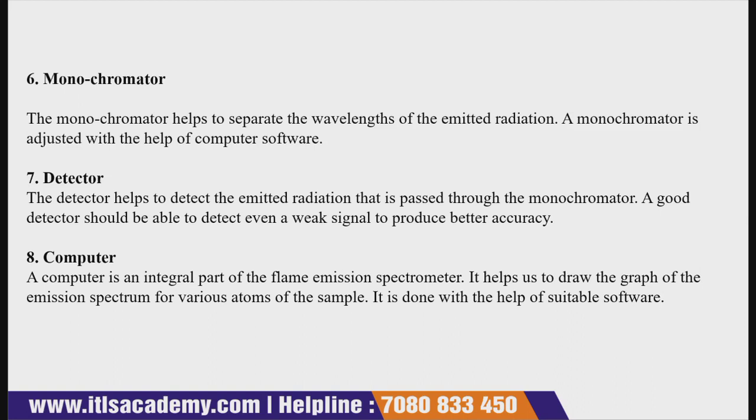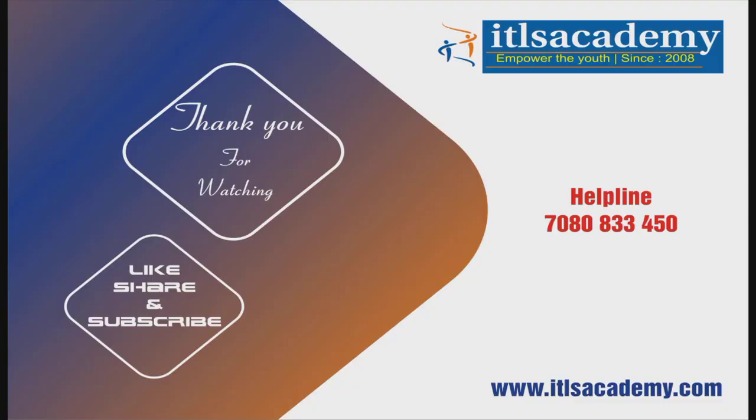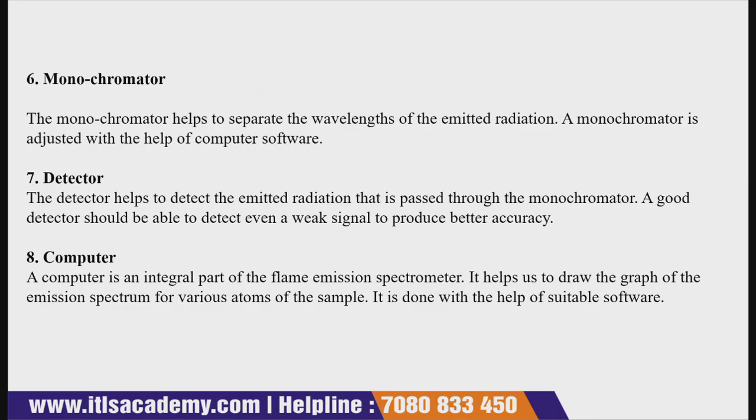Then comes the computer. The computer is an integral part of the flame emission spectrometer. It helps to draw a graph of the emission spectrum of various atoms of the sample. It is done with the help of suitable software. Okay, so that brings us to the end of the lecture.